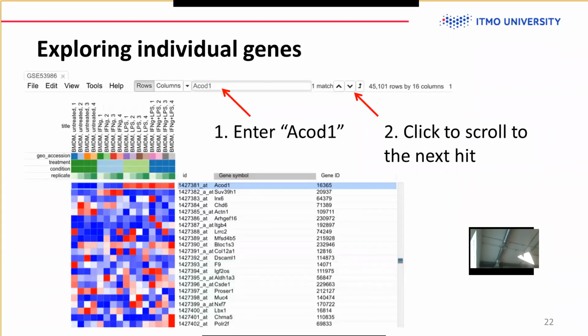So the question was how the data is stored in a microarray. We'll look at it, but basically it's just a matrix of numbers. Rows correspond to genes, columns correspond to samples, and we have some annotations. Further down, we'll look at some file formats for this.